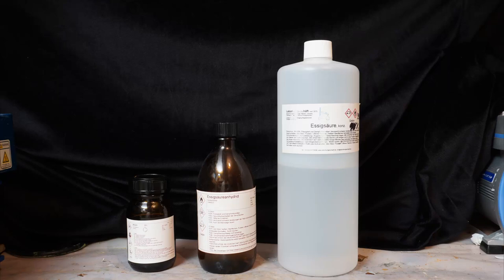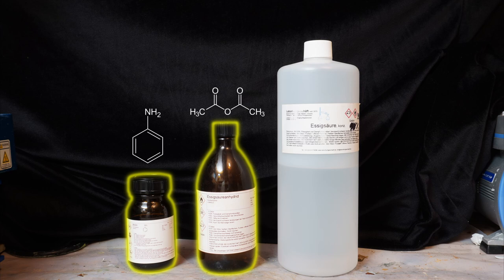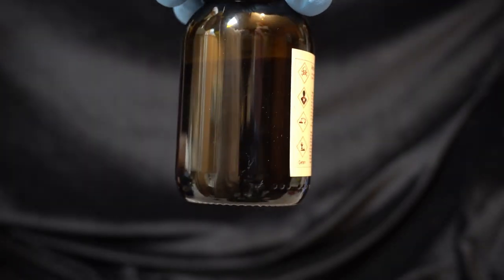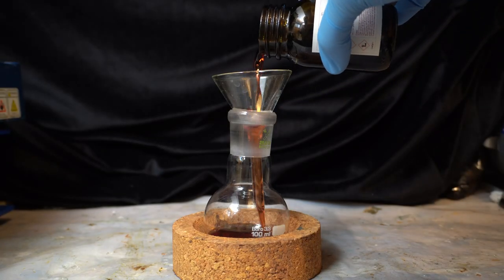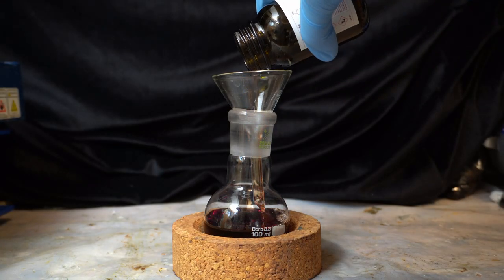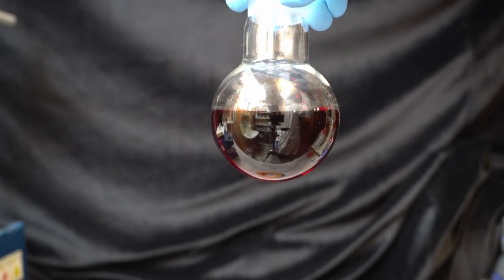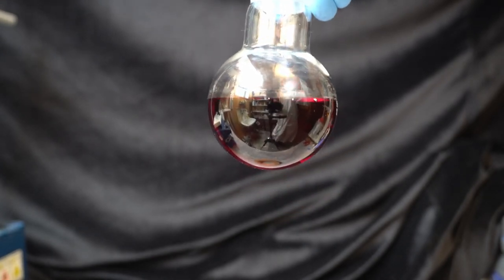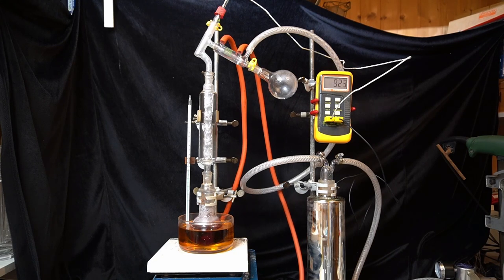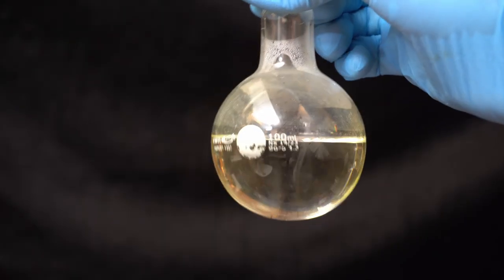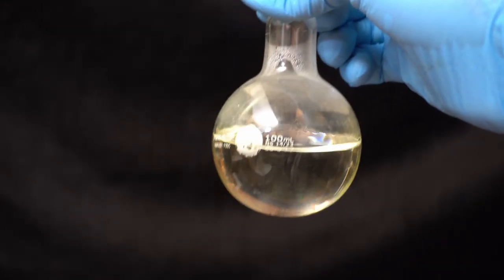Three chemicals are needed for this preparation: aniline, acetic anhydride, and glacial acetic acid. The aniline has again oxidized during storage and taken on a dark red color. This isn't a big deal for this kind of reaction and I could just use it like this, but I need it for another project as well, so I'm going to do a quick vacuum distillation. After that's done, we can start with the preparation of acetanilide.